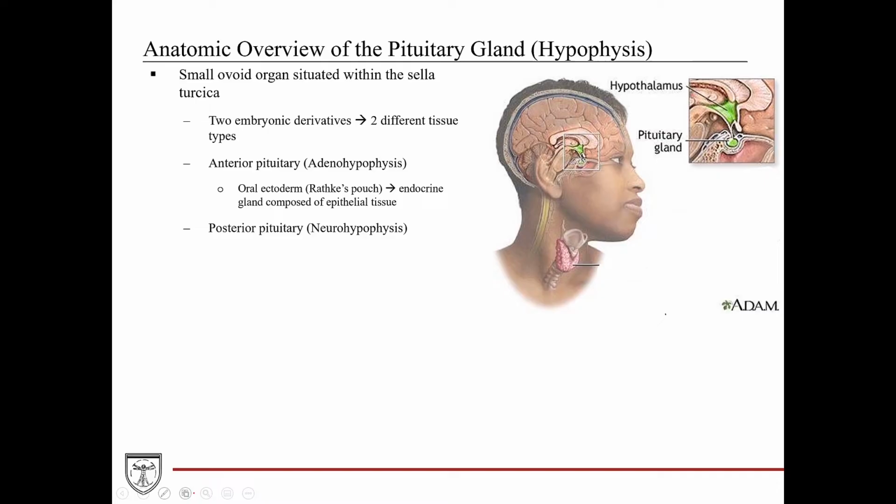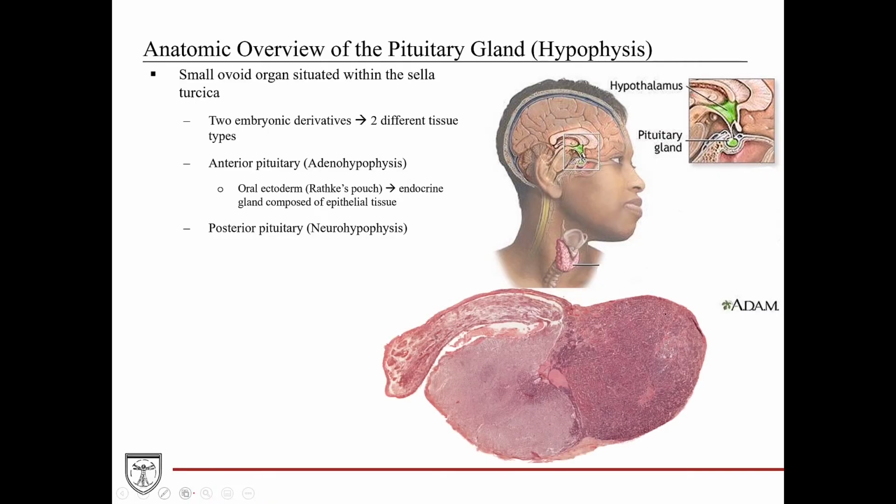Clearing all of those doodles and showing you the actual histology of the pituitary, from this macroscopic view, we can easily see the tissue staining differences between the adenohypophysis and neurohypophysis. This two staining pattern is based on the tissue makeup of the anterior and posterior pituitary glands.